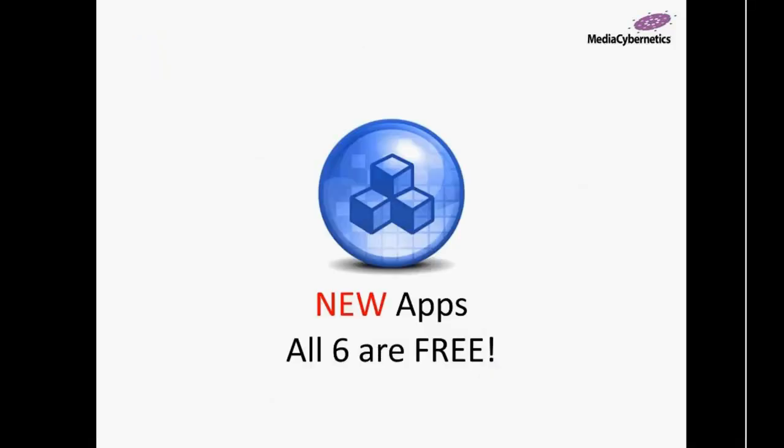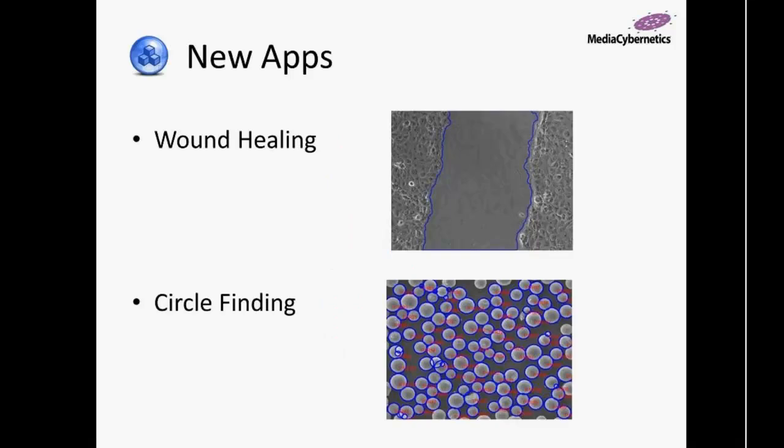Now speaking about apps, there's some great news here today. We have 6 brand new apps that we're going to release free of charge this week. We're going to be putting them on the Solution Zone right away, and we're hoping that you have a chance to take a look at those. We're going to start off with the Wound Healing app. This is designed to help researchers find the rate of closure of wounds.